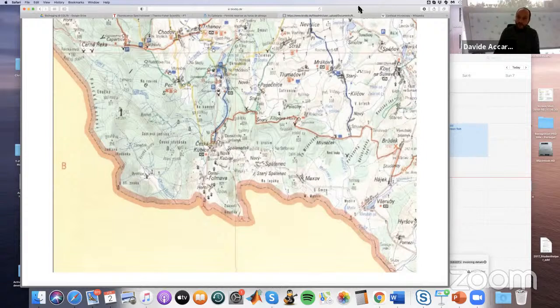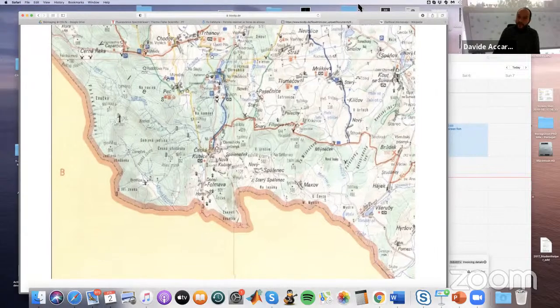And if you go to Wikipedia and check for the invention of the spinning disc, you will see that Yokogawa invented the spinning disc in the 1990s, but it's not the spinning disc that they invented.